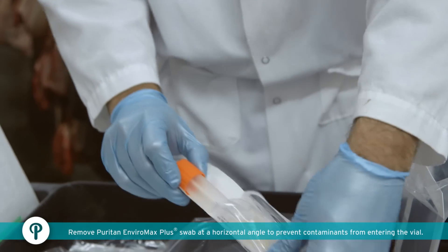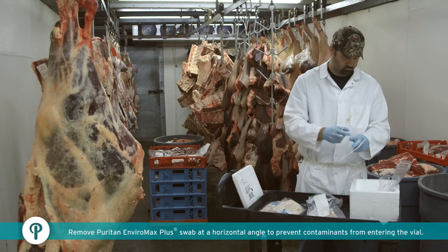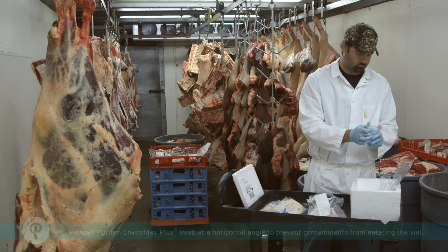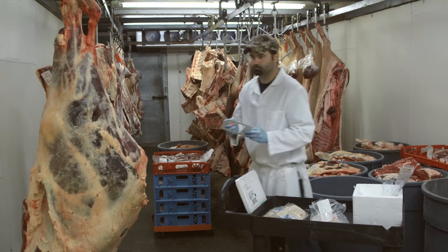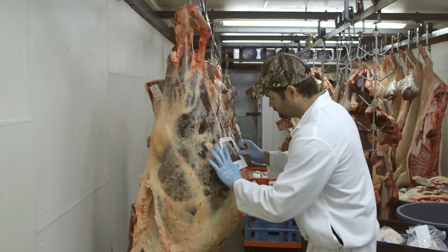Remove Puritan Enviromax Plus swab from vial by holding the cap and twisting counter-clockwise. Remove the sampling template from its bag and place the sampling template over the desired location on the meat carcass that is to be sampled.